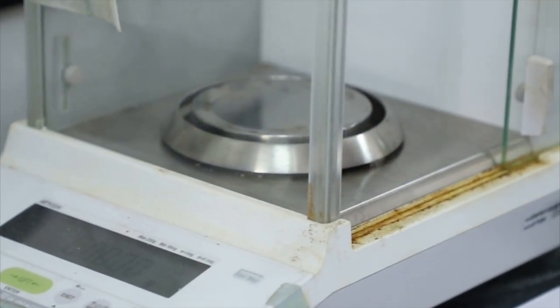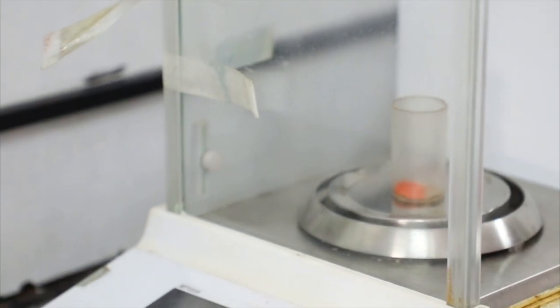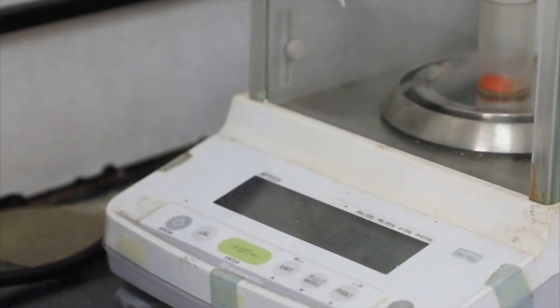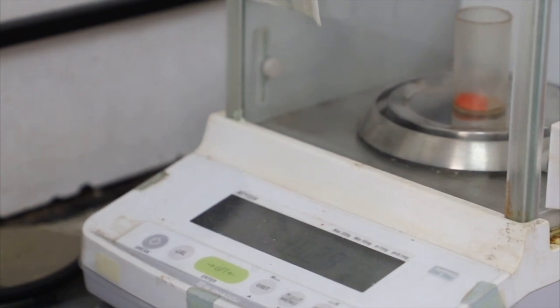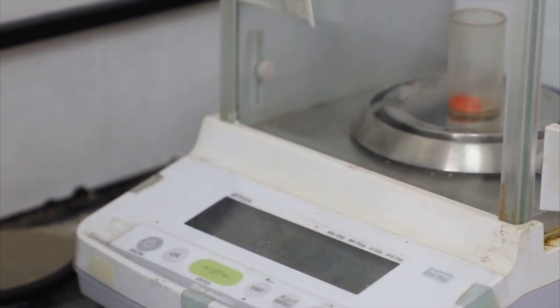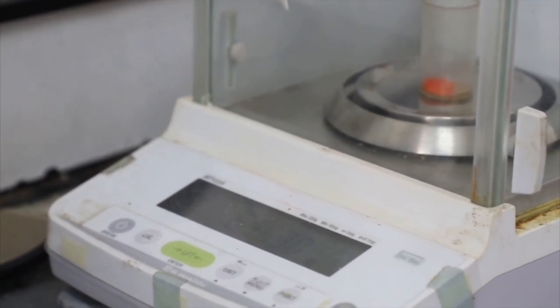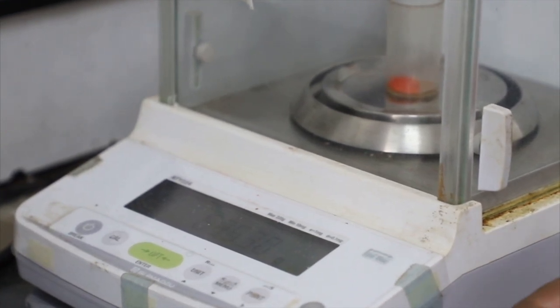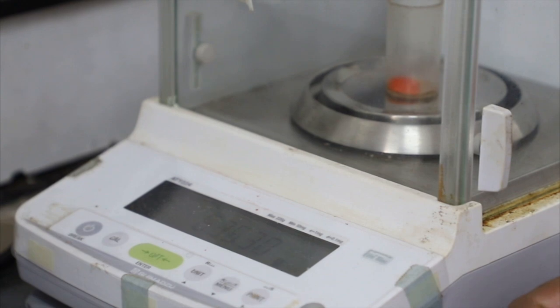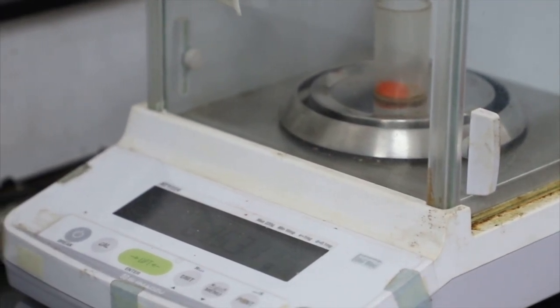So I am placing this weighing bottle along with the potassium dichromate crystal inside. The weight of the weighing bottle plus potassium dichromate crystal is noted down. It is 6.3530 gram. So now we have the weight of weighing bottle plus potassium dichromate.